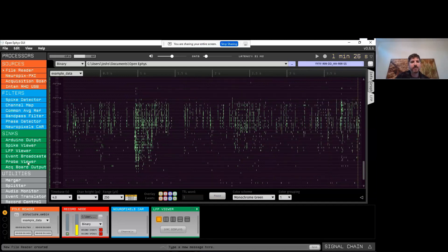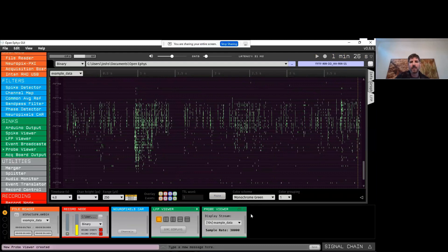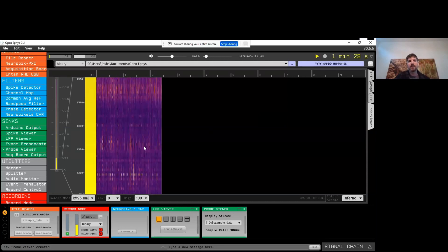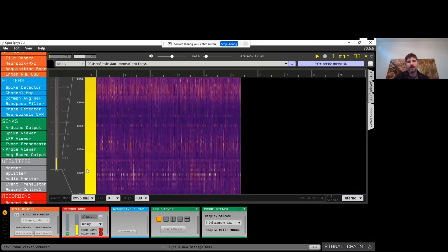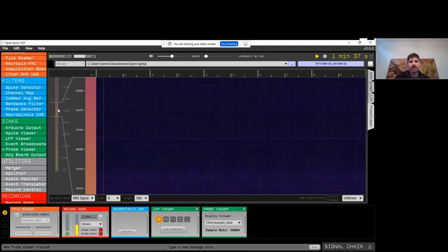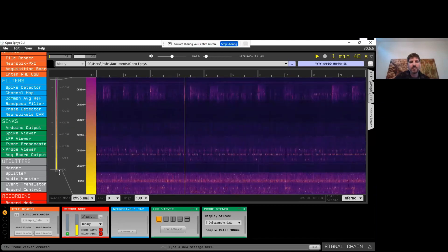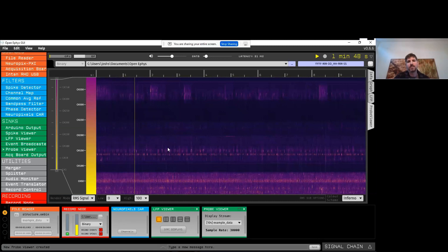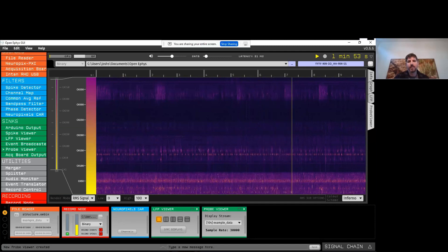Another visualization useful for Neuropixels data is the probe viewer. We can add this to the signal chain. This displays data as a heat map with channels on the y-axis and samples or time on the x-axis. You can scroll through the whole probe or zoom out to display all the data at once. This is the plugin you can connect to planning software like Pinpoint or Neural Trajectory Explorer if you want to visualize the brain regions your probe is passing through side by side with the physiology data.